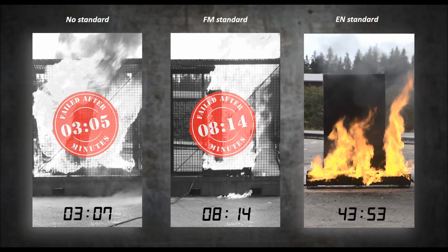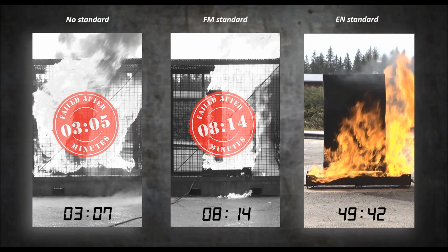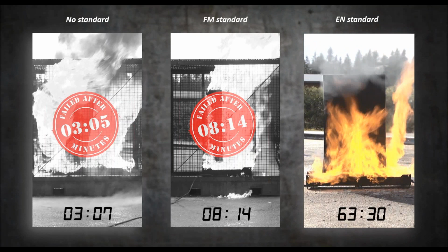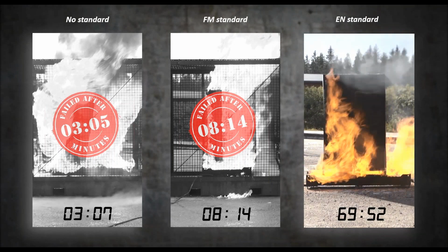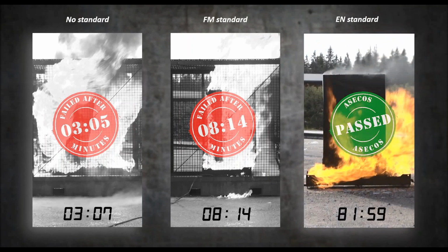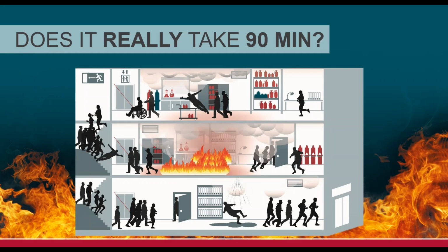And then the 90-minute cabinet's going to run on for 90 minutes of testing. I'm going to spare you watching that, just so I can keep my time frame and show you some videos. But it's really the difference between no standard, 10 minutes or 90 minutes, and what you feel safe designing around. To me, if we create our high hazard rooms, we create everything that we know within a space to have at least 90 minutes of fire resistance. Even our 2-hour rooms only have 90 minutes of fire resistance because we put a 90-minute door on it. Codes allow us to. So 90 minutes, I would try to achieve in all scenarios.